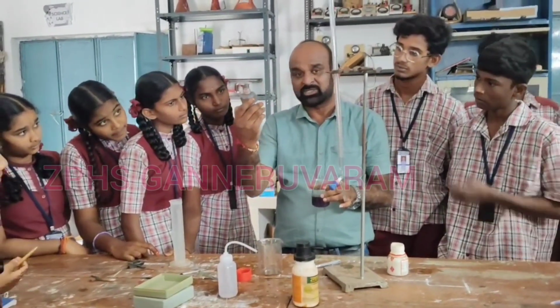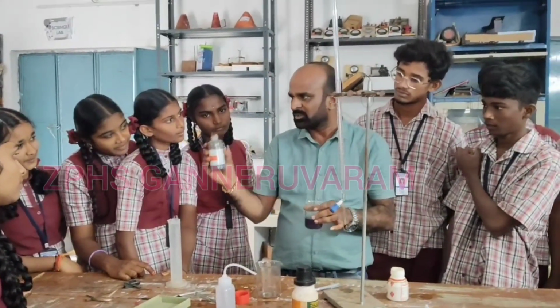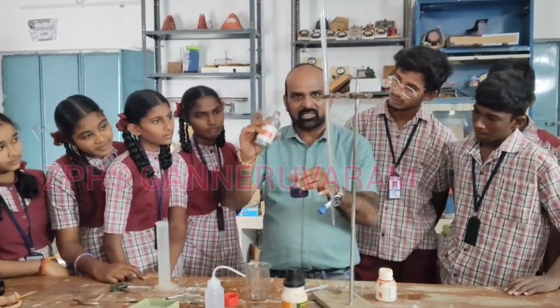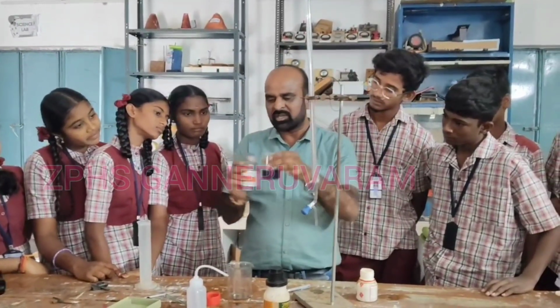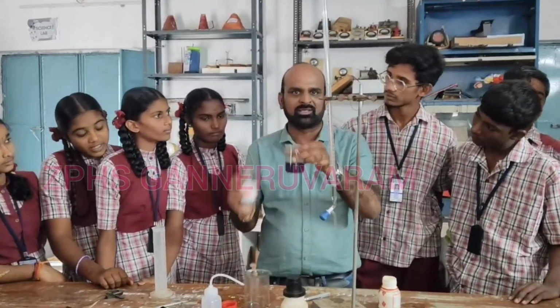Red litmus paper is not available, so I am using the red litmus solution. I used red litmus solution, adding 2 drops. This sodium hydroxide solution turns to blue color.